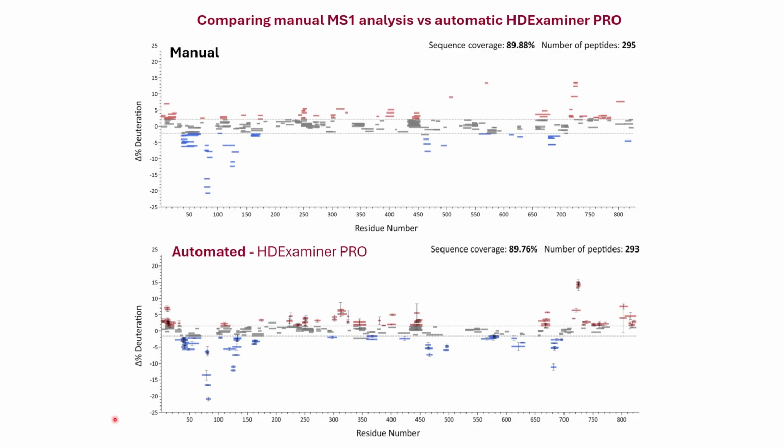On the bottom side of the screen here, it's the same peptide, the same project, but now processed using DIA data. And so you can see here that the binding sites are actually quite similar on both analyses. So in fact, most of the Woods plot is very similar in both cases.